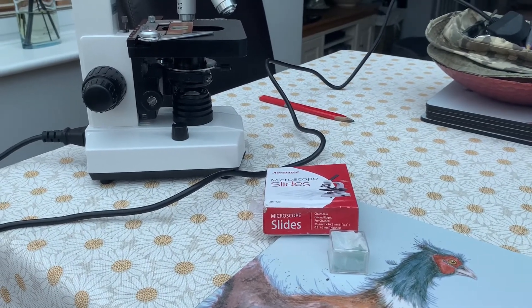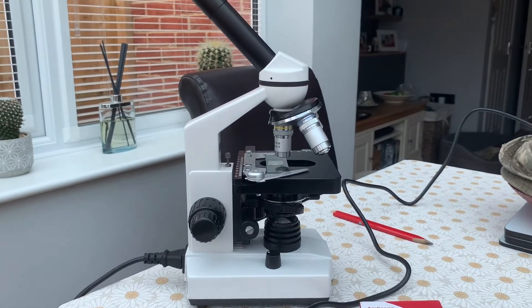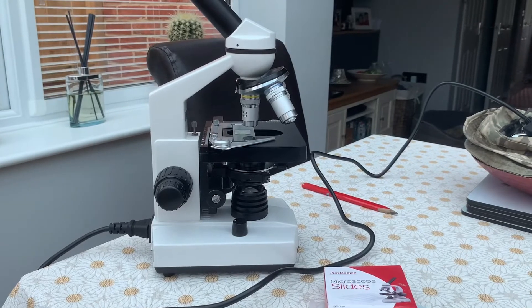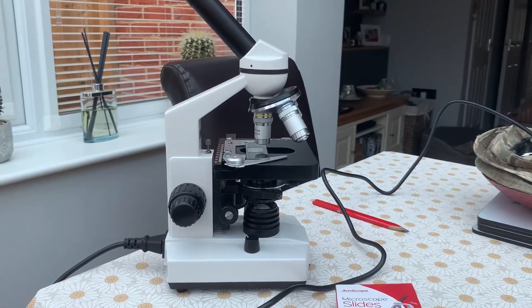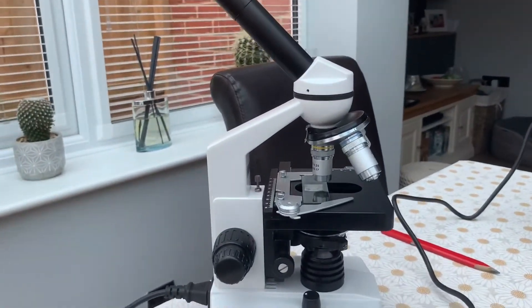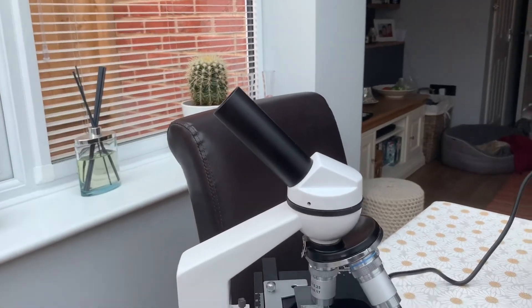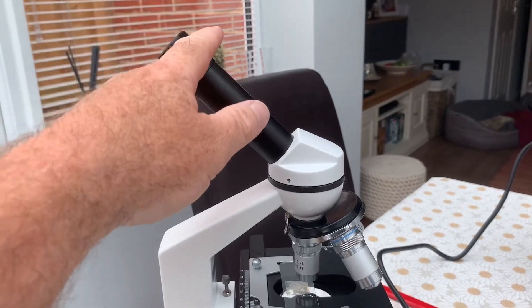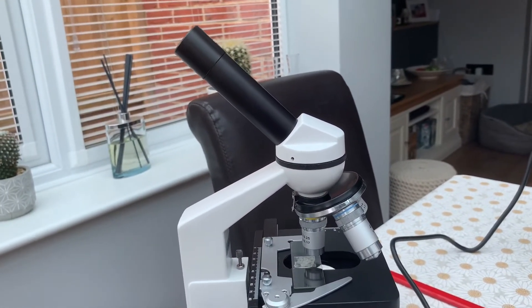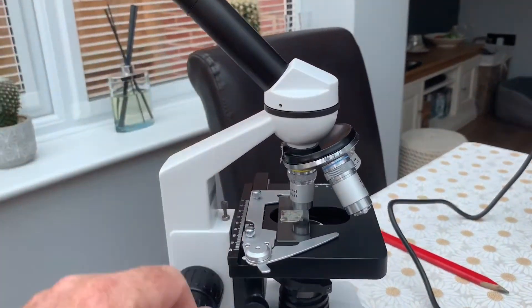There are plenty of videos out there showing people taking scrapes, but I just wanted to quickly run through the microscope — what to look for, what pieces to have, and how it basically works. For those of you thinking of getting a microscope, I hope that little bit of information makes life easier. The main things: make sure you've got a removable eyepiece, because you can buy USB cameras that drop in or buy clips to fit your mobile phone over for taking pictures.